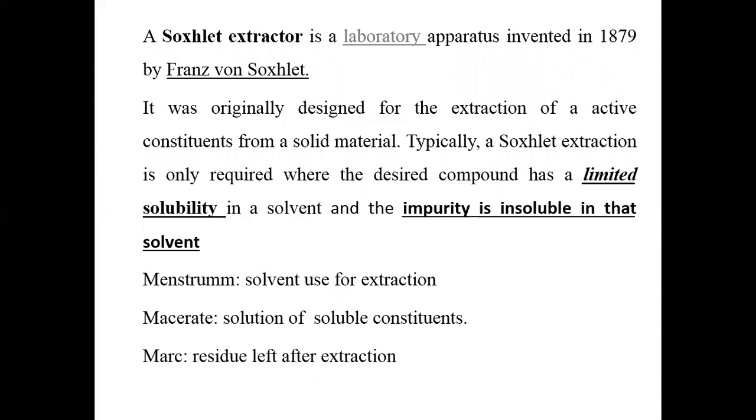So, these are some terminologies we use during the extraction process. Menstruum means solvent used for extraction. Macerate means solution of soluble constituents. Marc means residue left after the extraction.